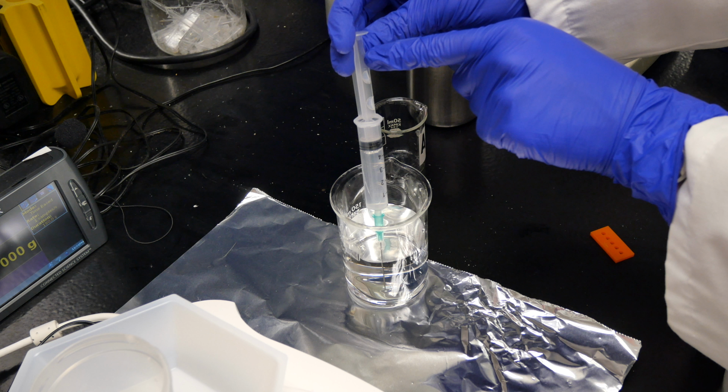You can put tactile markings on a syringe plunger. Here I have a photo of a 5 milliliter syringe. I have bump dots cut in half placed on the plunger to mark different volumes. The syringe just naturally happens to have a notch at the 5 mL mark, so I can use that. You can also use a blade to cut into the plunger to feel that as well.